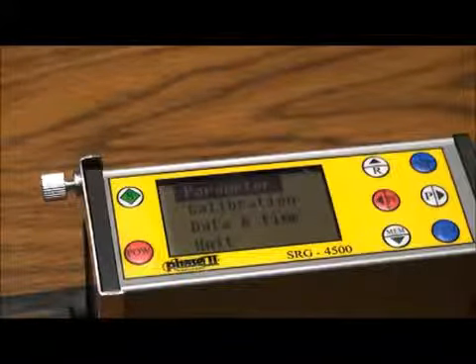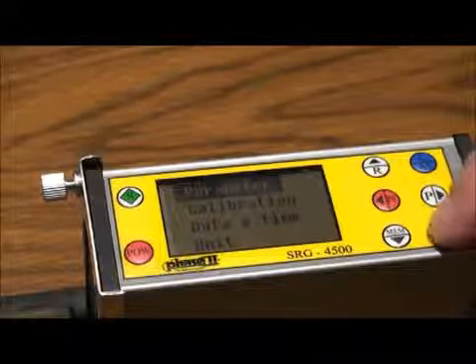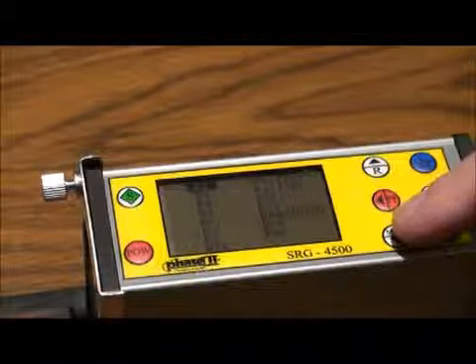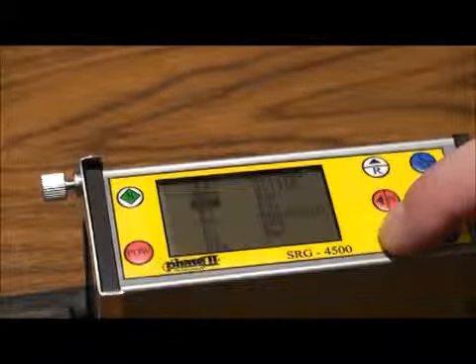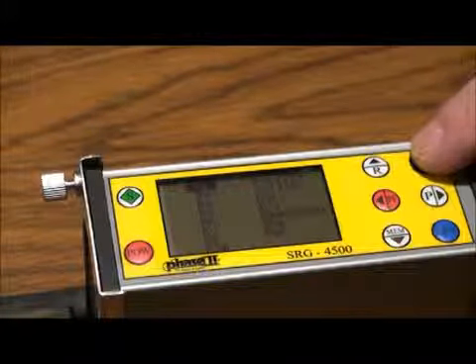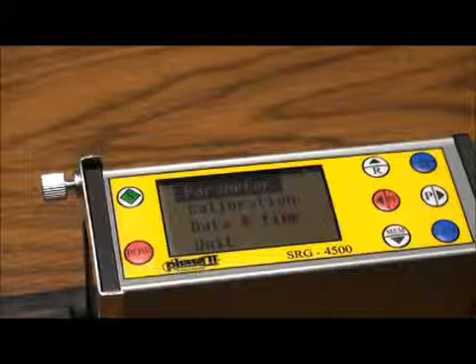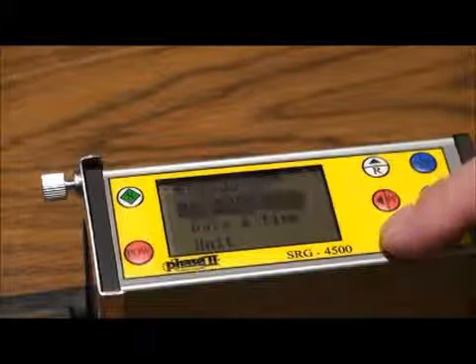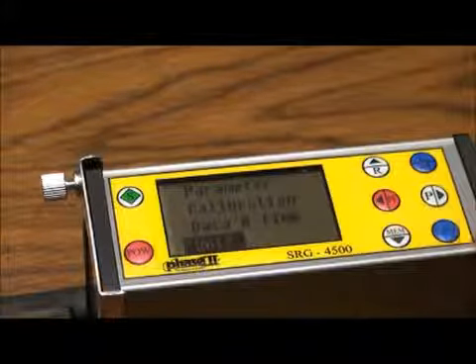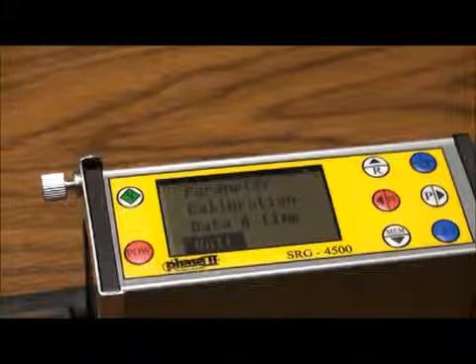Once on parameter, press the level key and you can select the roughness parameter of your choice. Once selection is made, press the LM button to return back to the menu. From here you can enter calibration, date and time, measuring unit in metric, and the language setting.